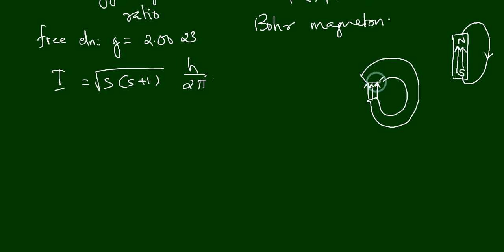In this horseshoe magnet also, you have to consider the same way. The lines of force are from south to north. You can consider this as the south pole and this as the north pole of the horseshoe magnet. So inside the magnet, the lines of force will be like this, from south to north. When you are considering the lines of force outside the magnet, in this area, the magnetic lines of force will emerge out of the north pole and then go to the south pole.